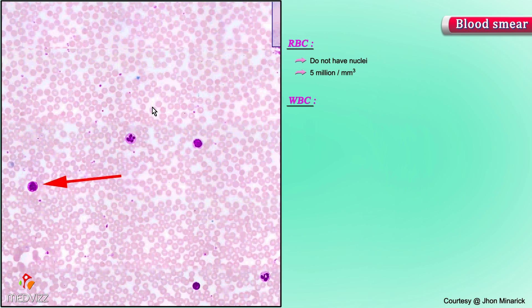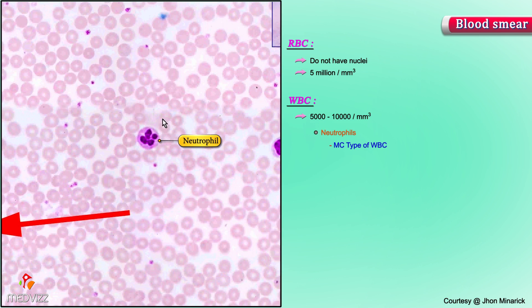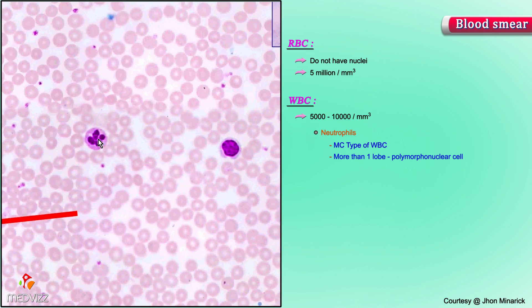The white cells are about only one thousandth as common — only about five to ten thousand per cubic millimeter. The white cells are five different kinds of cells. By far the most common type is a cell which has more than one lobe, which is why it's called a polymorphonuclear cell. They're also called polys, neutrophils, or neutrophilic granulocytes. This is a classical neutrophil having more than one lobe.